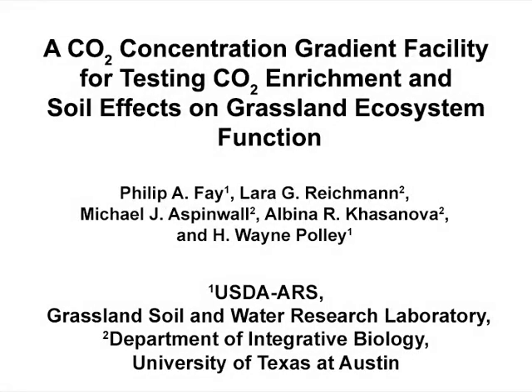The overall goal of this experiment is to determine how past and future increases in atmospheric carbon dioxide affect grassland ecosystem productivity, water balance, and carbon cycling. The study includes monitoring the effect of carbon dioxide on different soil types.